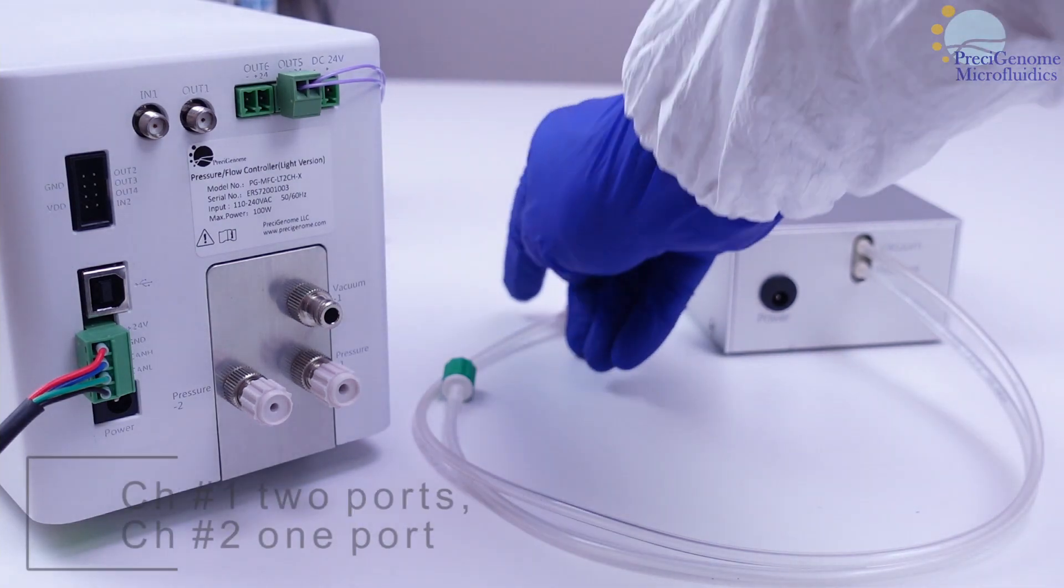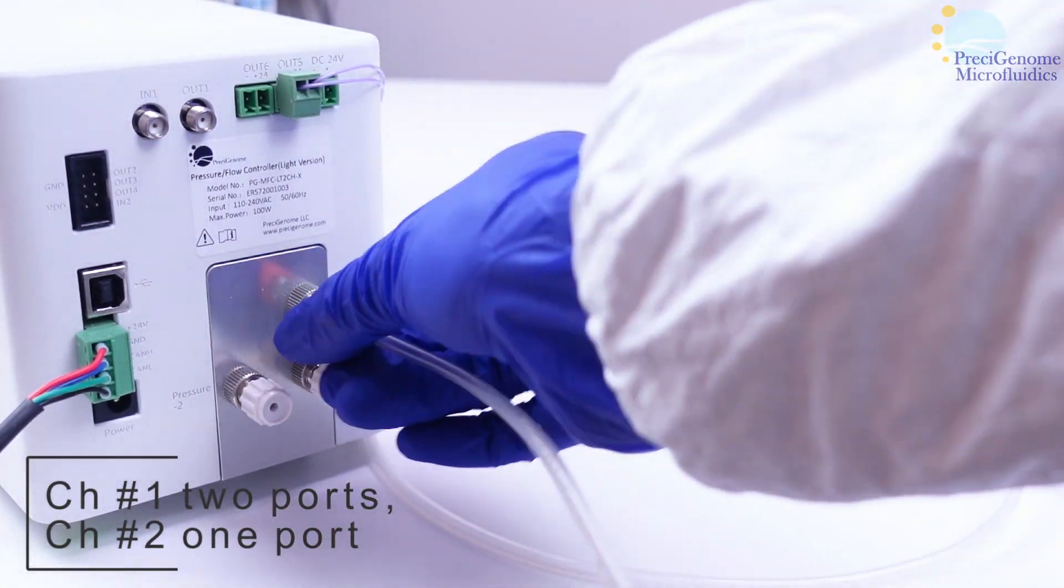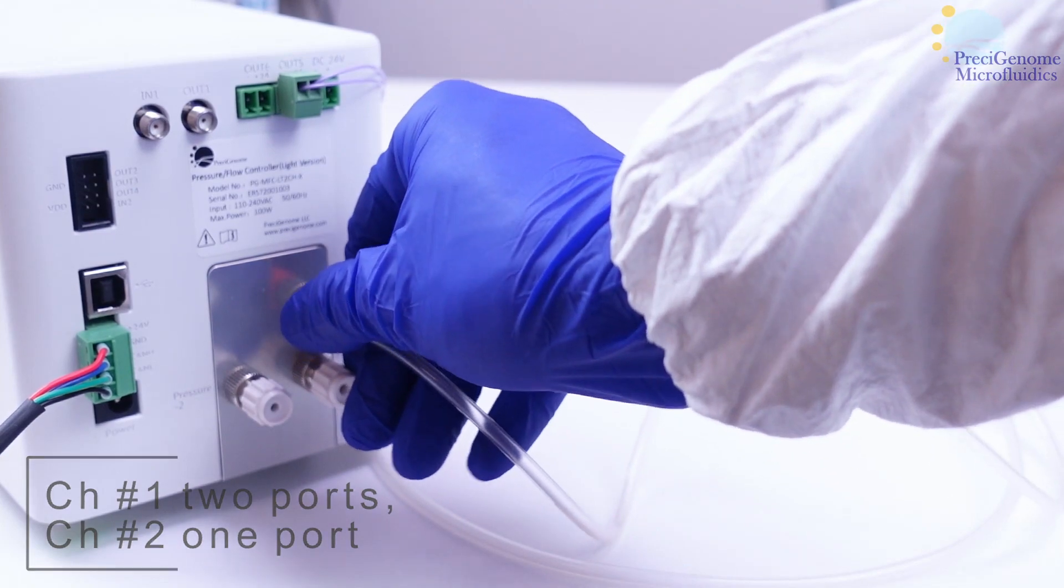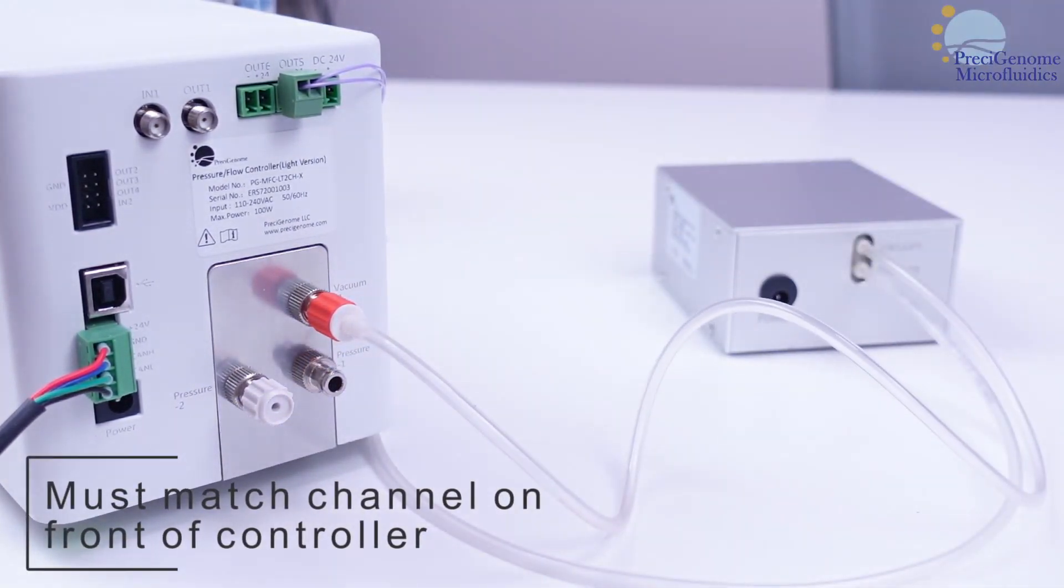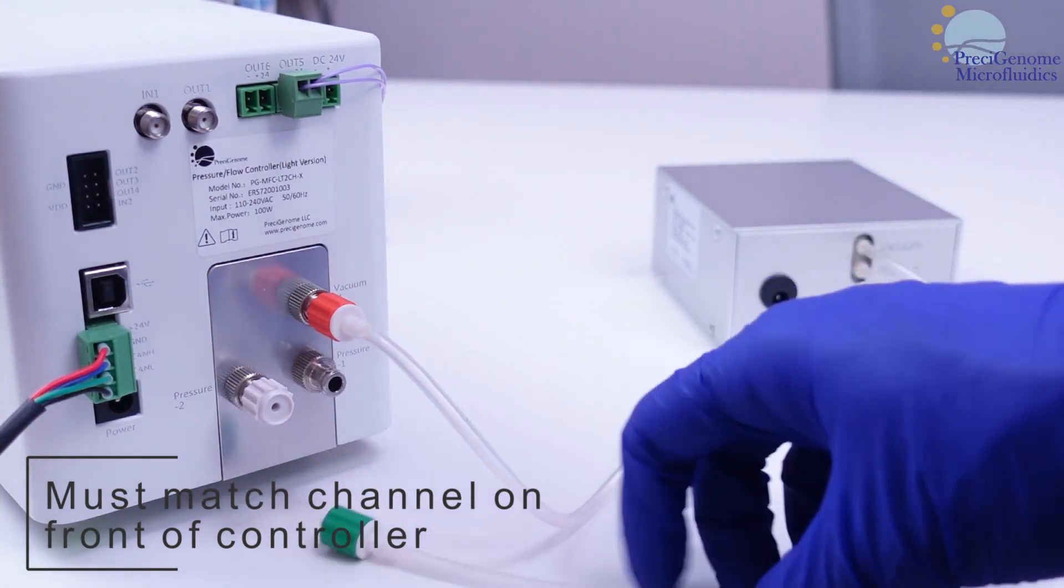While channel 1 has two ports for vacuum and pressure function, channel 2 has one port with pressure function only. In either case, make sure to connect the pump to the same channel being used in the front.